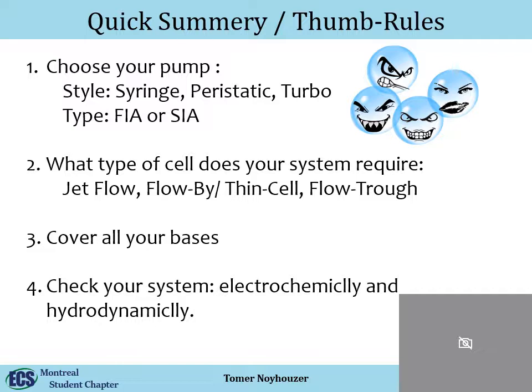Just think about it. If you have a carbon sponge that you can buy commercially, how do you connect it to your potentiostat without having a hole in your system? So you have to design a holder for that electrode, right? So they're more complicated, but they're much better.